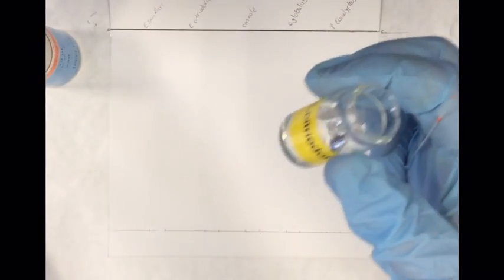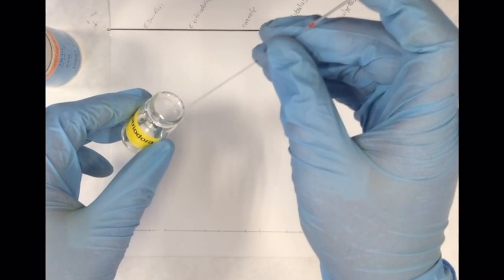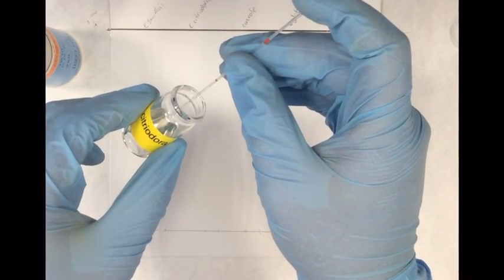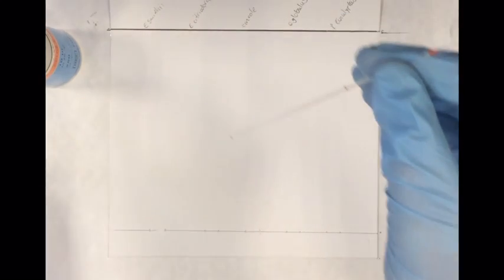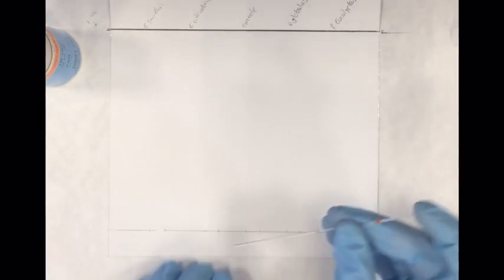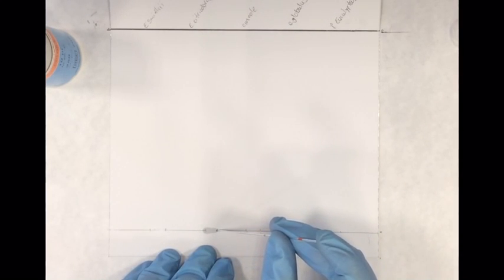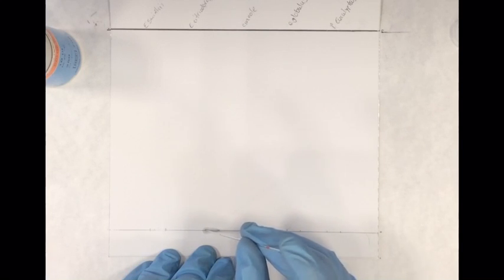Use a clean spotter for each new sample. You can control the amount of liquid going into the spotter by using your index finger and placing it over the hole on the top of the spotter. By releasing the index finger, this will allow the liquid to exit the spotter.